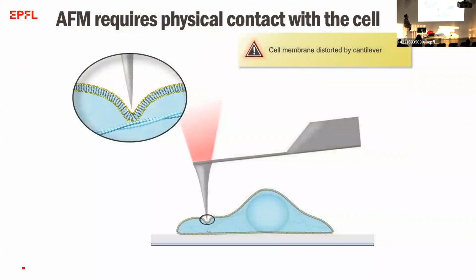However, all of the things that I just showed you were not living things. And I started this whole thing because I wanted to look at living things. I was just looking at molecules. The problem, if you apply the same advances and the same technologies to the smallest living objects, cells, is that the atomic force microscope, as the name already says, requires a force interaction between the object that you're looking at and your probe, the cantilever.